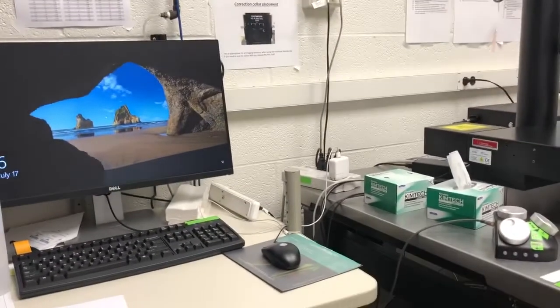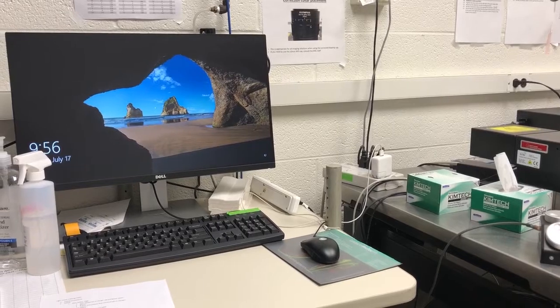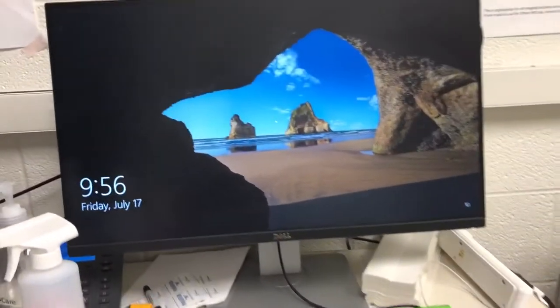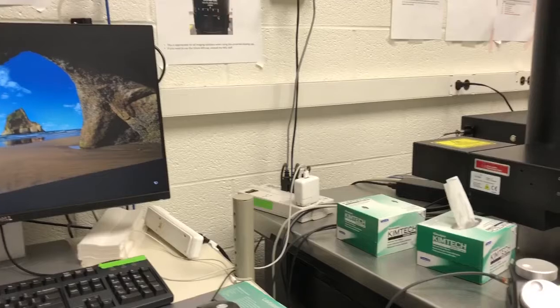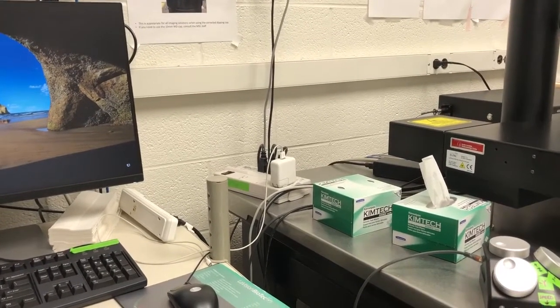With the discussion of risks and safety out of the way, we can now start talking about how to turn the system on. You can see the monitor is on because I have already logged into the iLab kiosk. Before you start using the system, step number one is logging into the iLab kiosk.